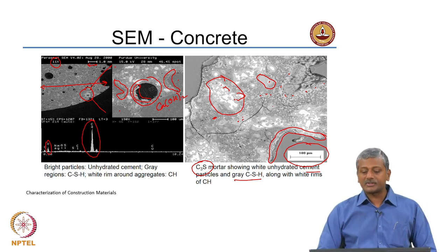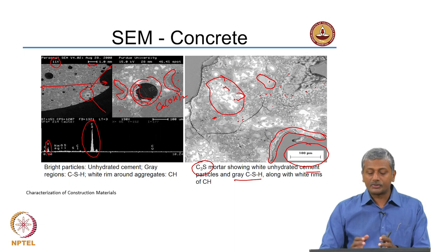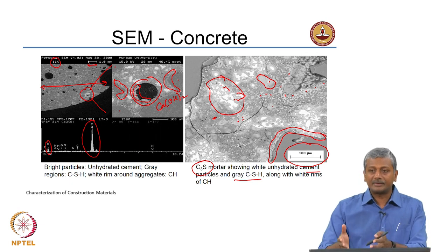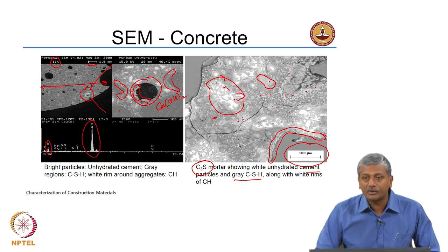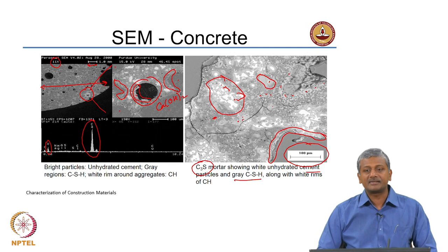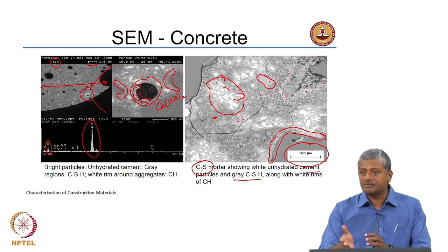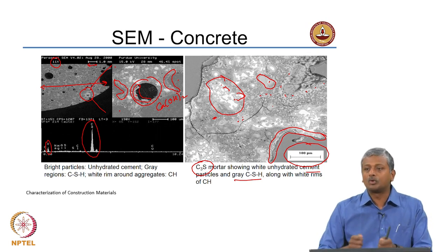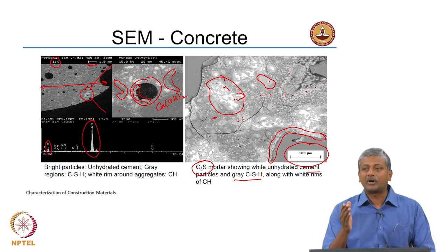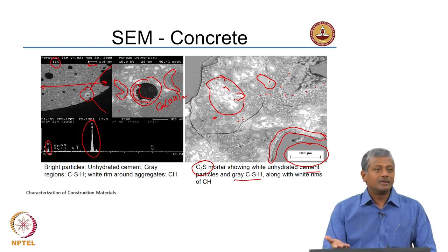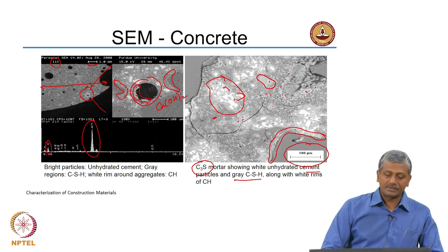You cannot directly appreciate the difference between calcium hydroxide and inner CSH in terms of grey levels in this image, but if you do a proper contrast, you will actually get calcium hydroxide very clearly apart from your inner CSH in terms of difference in grey levels.